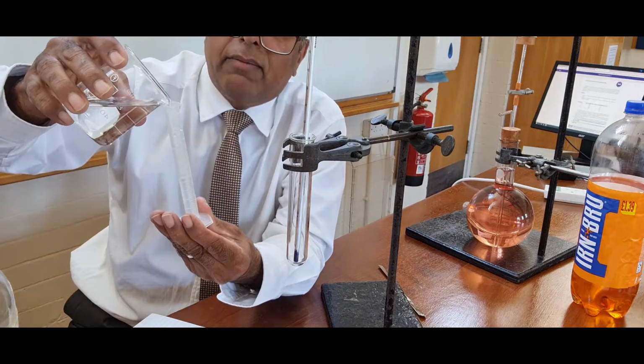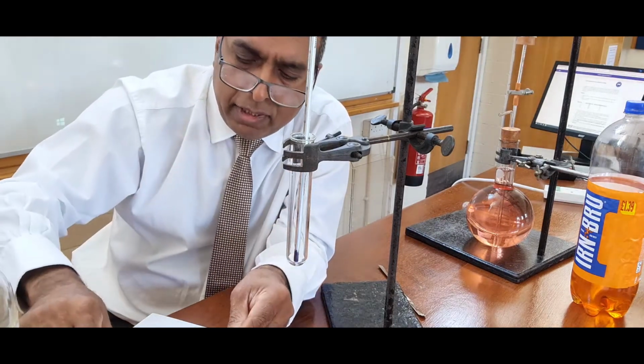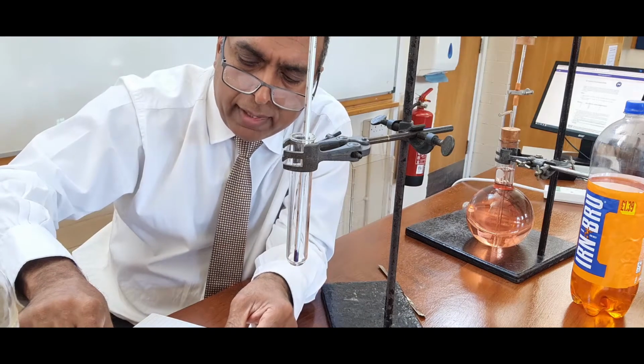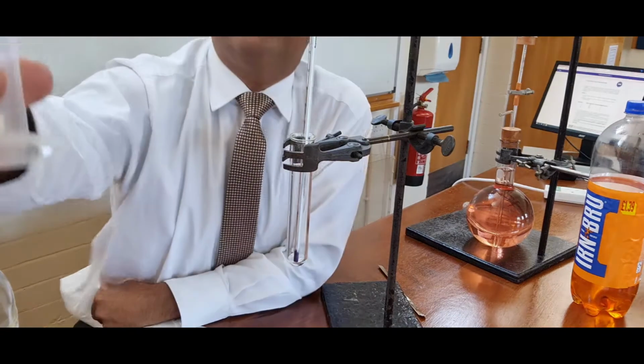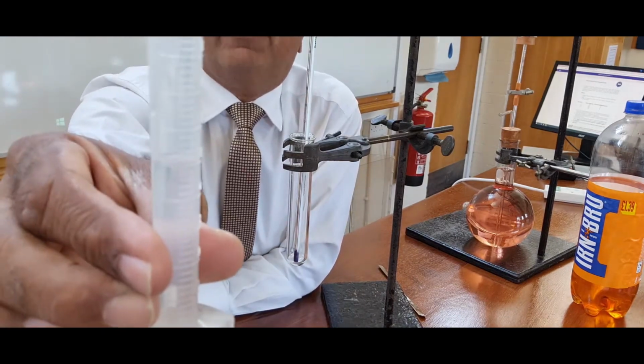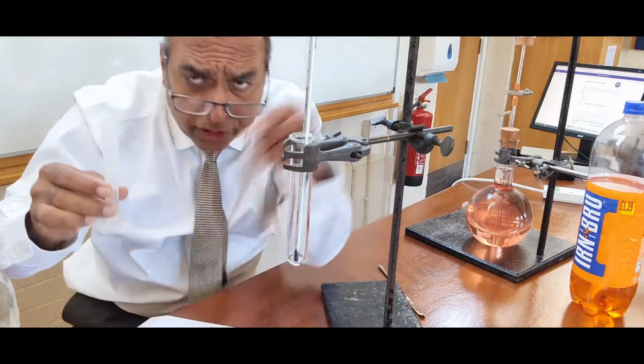Sorry guys, maybe I should have got 5 ready before I started the demo. But I'm trying to get 5, I keep going under and over. There. So, that is 5 cubic centimetres of distilled water.